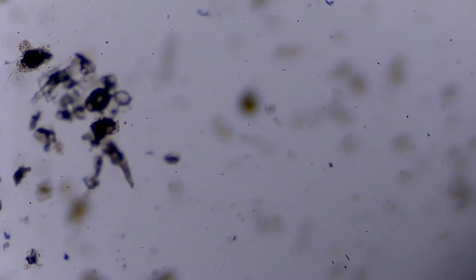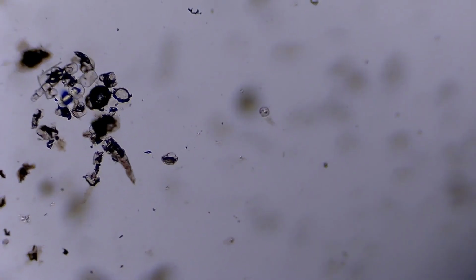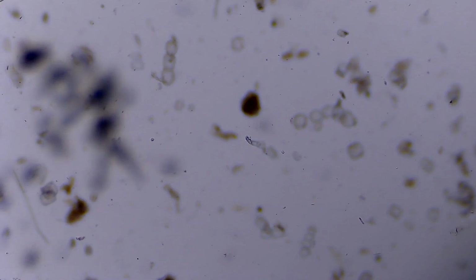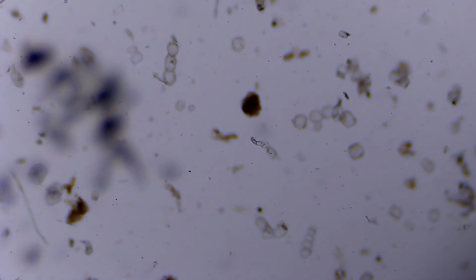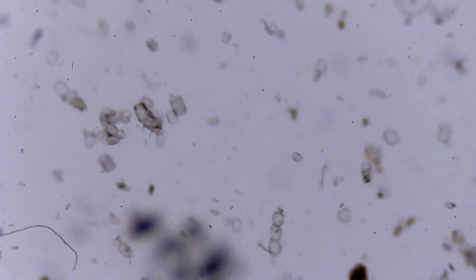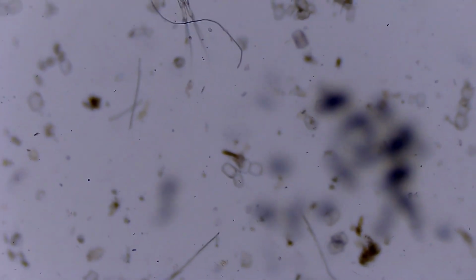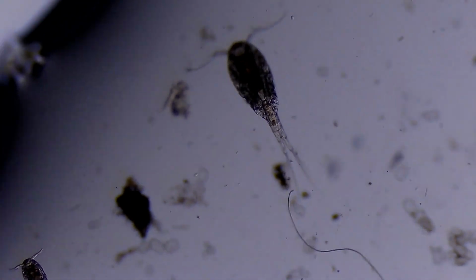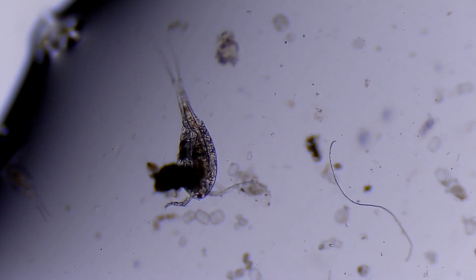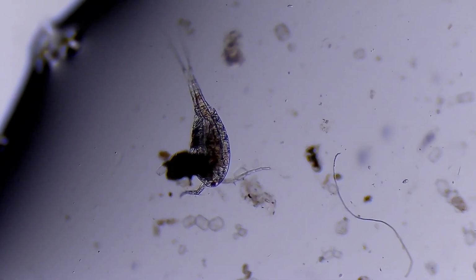But in this single droplet, you can see tons of little bitty things moving around. That's probably paramecium, to be honest. Little tiny infusoria moving around. There's tons of chunks of things. It could be decaying organic matter. And then there's these giant copepods. Well, they're not really giant. They're microscopic. But under the microscope, they look gigantic.